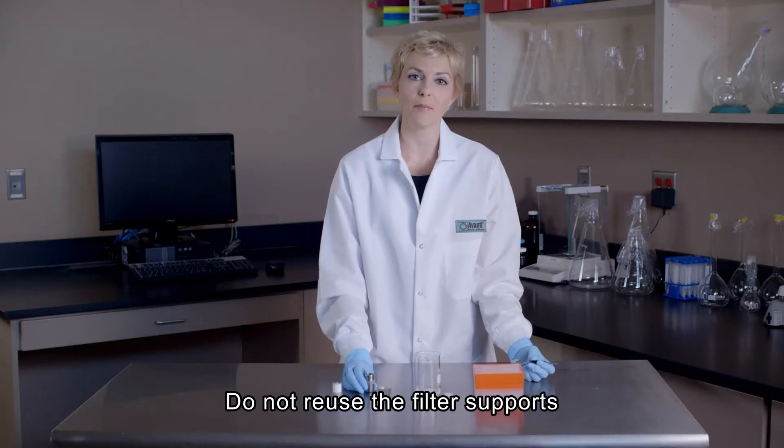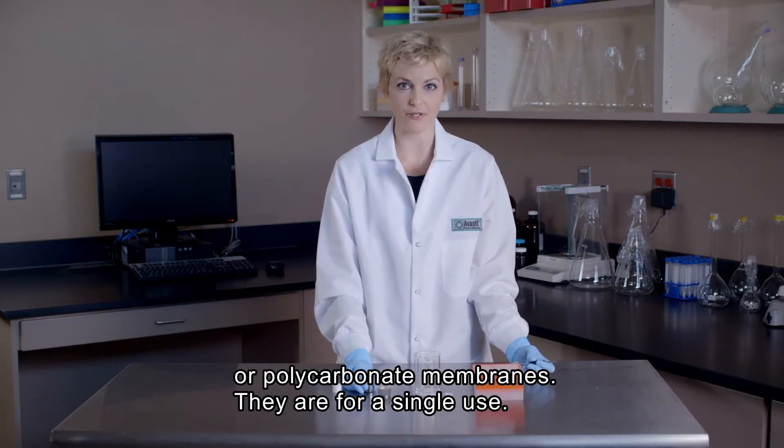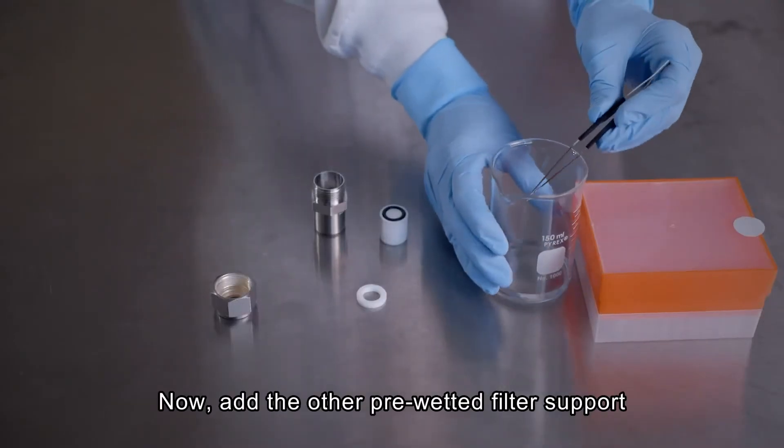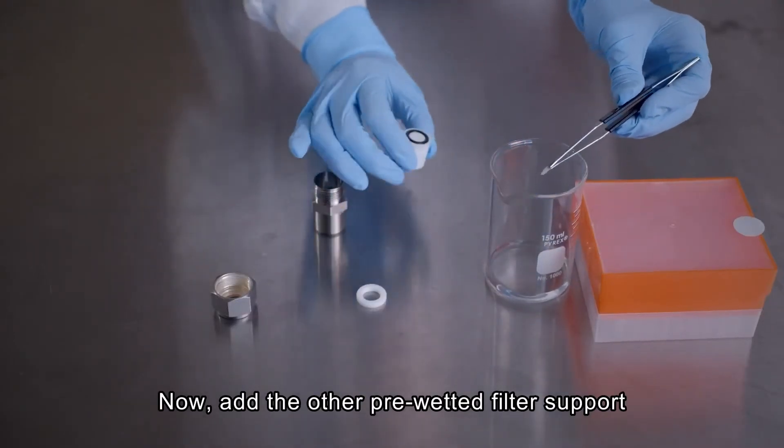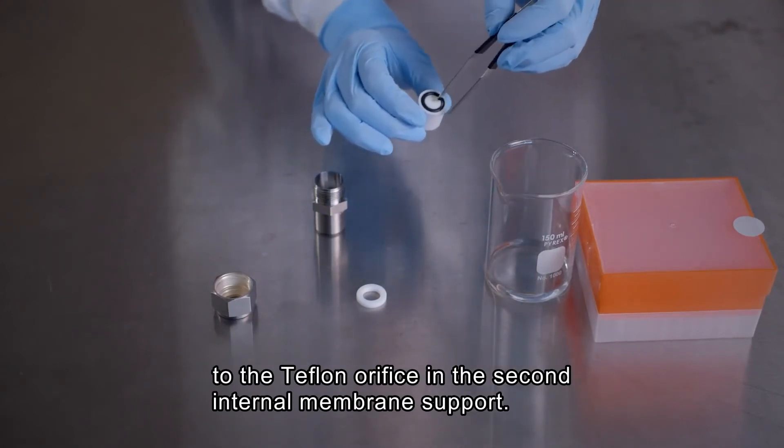Additionally, the polycarbonate membranes and filter supports are intended for single-use liposome preparation and should not be reused. Now add the remaining pre-wetted filter support to the Teflon orifice on the inner diameter of the O-ring of the remaining internal membrane support.